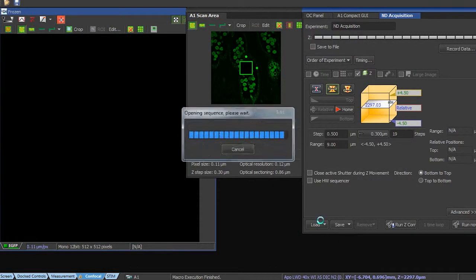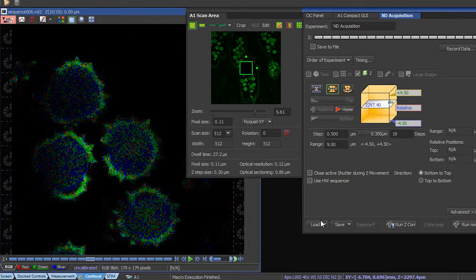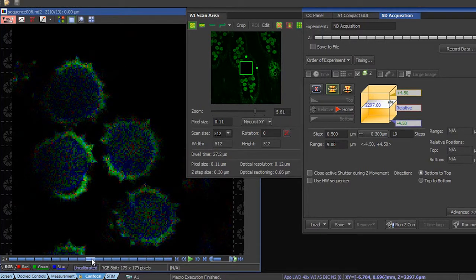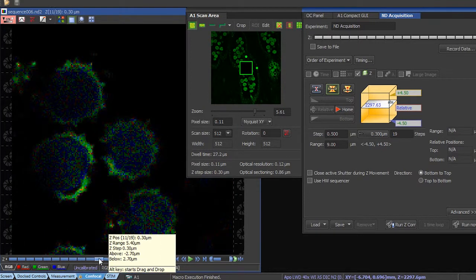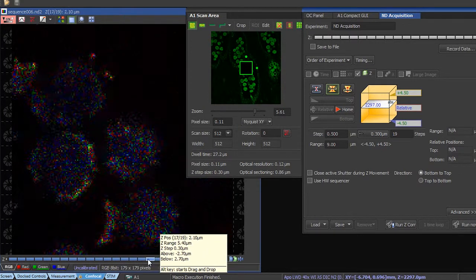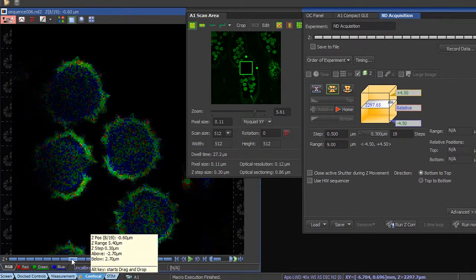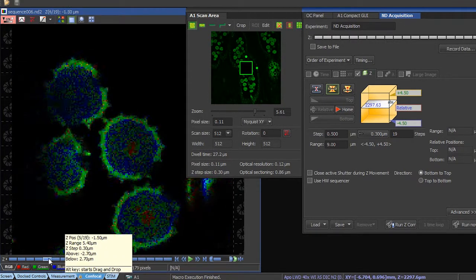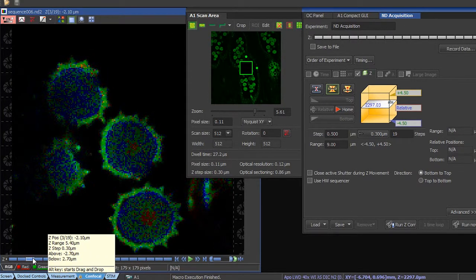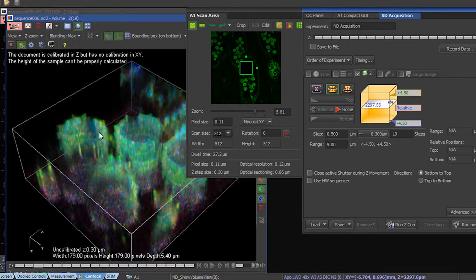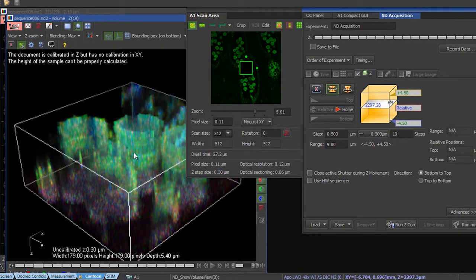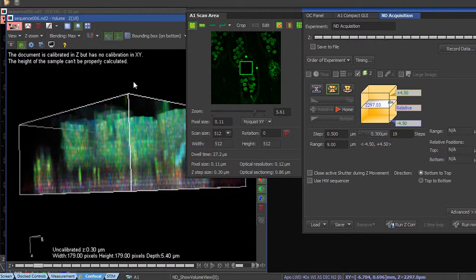So the images are then being transferred to the NIS software. And with the mouse here, I can scroll through all those 19 layers. If I then want to create the 3D image, I go to this little icon up here. And here it is, our 3D stack.